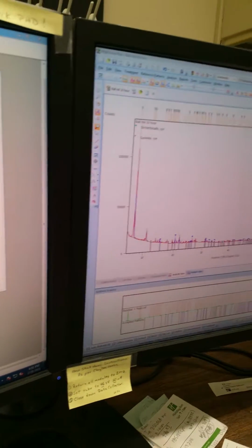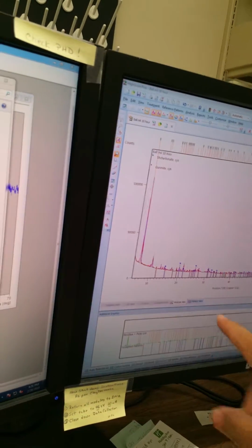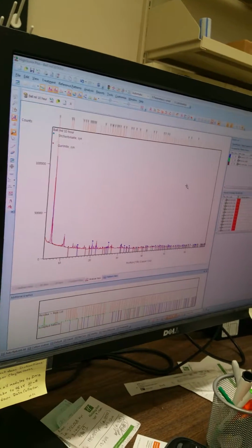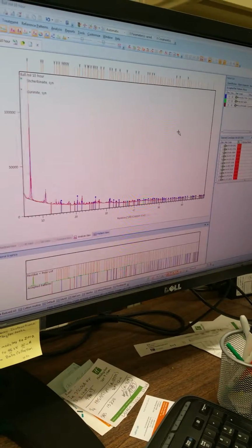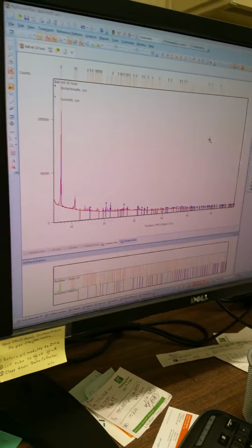Suppose we have the same material, but we have different ones. Suppose for this peak we have 3 or 4 materials in the library. So how to understand out of these 3? That is the score. Okay, based on the score I will pick it. After that, we have to save it in that condition, right?